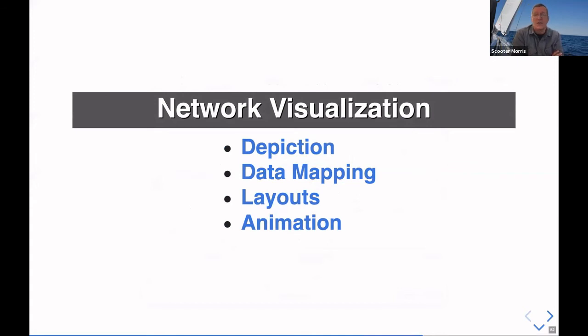It has amazing visualization tools, and so even from R, you can take advantage of all this and use these visualization tools. The other thing is the plethora of apps, which have a number of different capabilities that are exported and available from within R. And I'll talk about that after our practical.